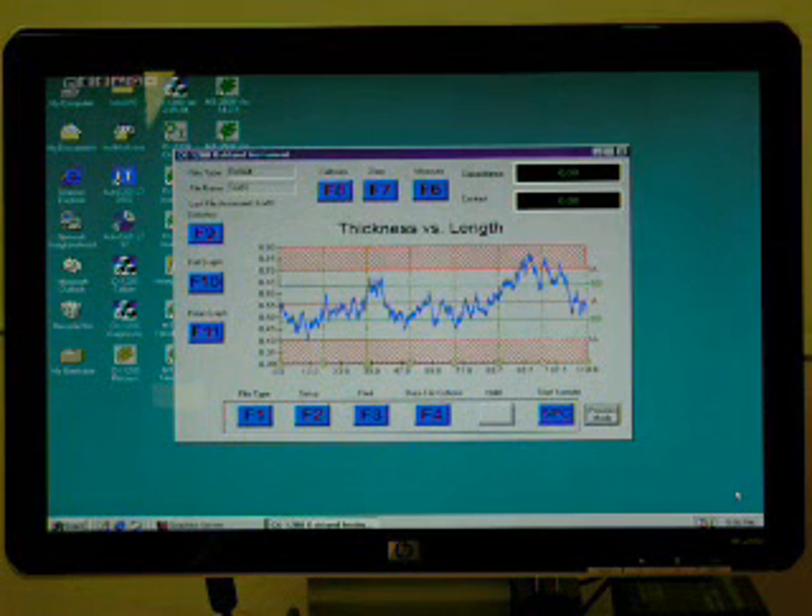The model MX-1210 adds a drive mechanism for automatically pulling sheet samples for thickness profiling. Our model MX-1300 quality control software records, graphs data, calculates statistics values, and provides reports for quality control record keeping.